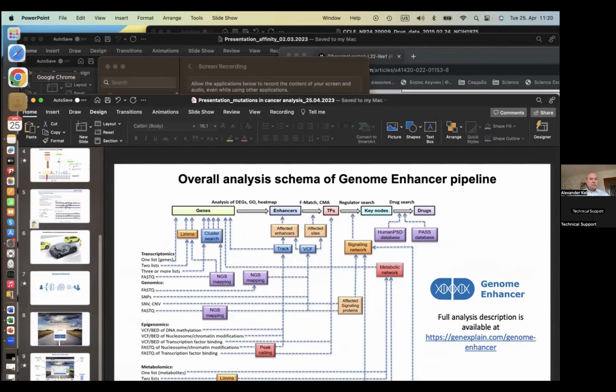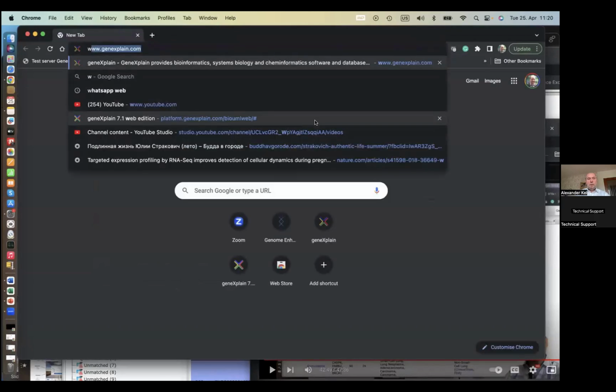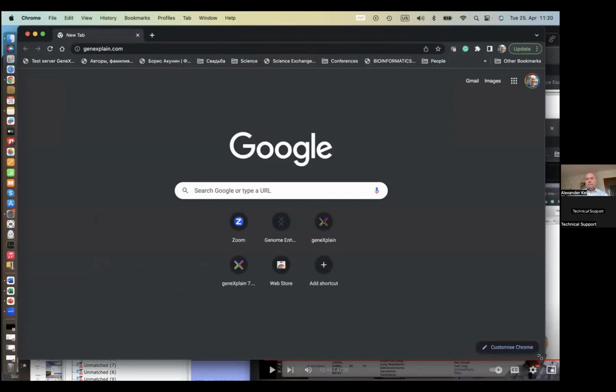Okay, so I will go to our website, geneXplain.com.